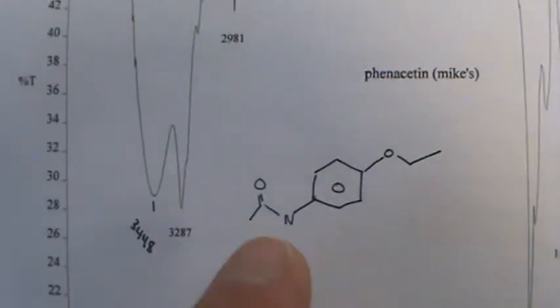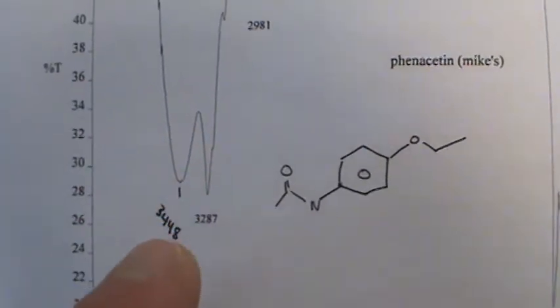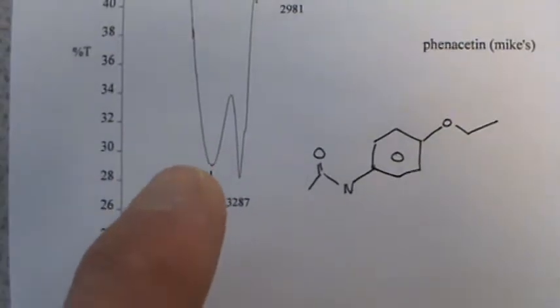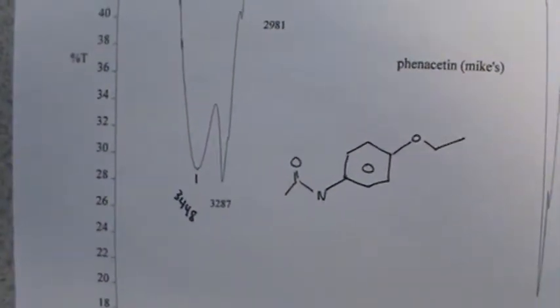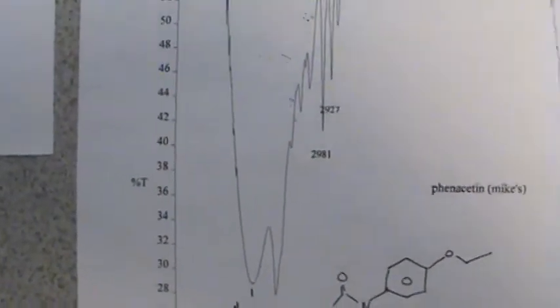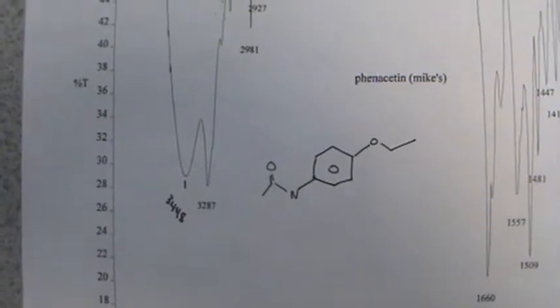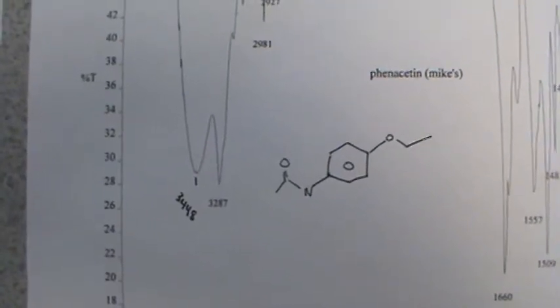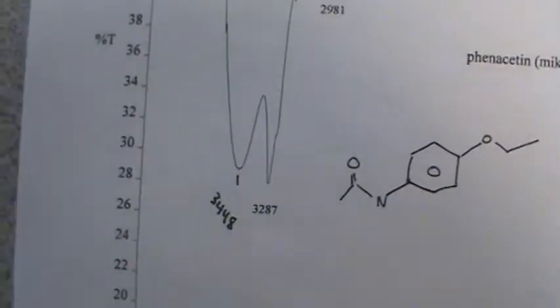That's fine. We still have a hydrogen on the nitrogen. That peak right there matches exactly what Pavia has, a little bit higher, but that's fine. And I believe it would say we have another one at 3200. So whose ever this is, the 3287, not 100% sure exactly what that comes from. So let's go back to Pavia.